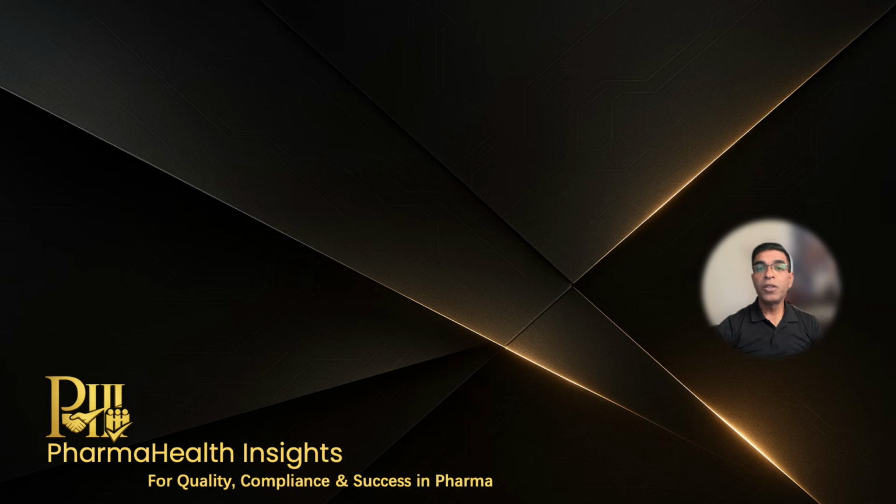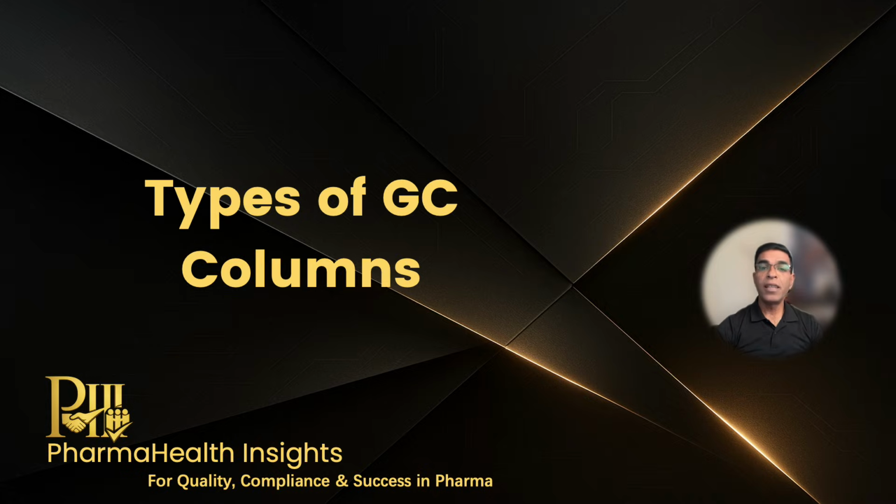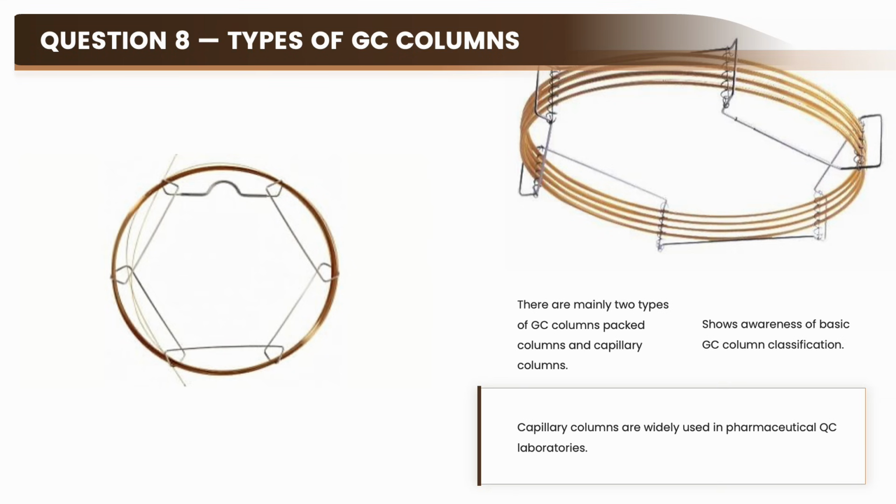Now, your interview will shift into deeper technical areas, GC columns and injection systems, and that's exactly what we will cover next. What are the types of columns used in gas chromatography? You should answer like this. There are mainly two types of columns used in GC, packed columns and capillary columns. Packed columns are the older types and have larger internal diameters, whereas capillary columns are narrow bore columns offering better separation. This answer works because you directly address classification first, which the interviewers always expect.